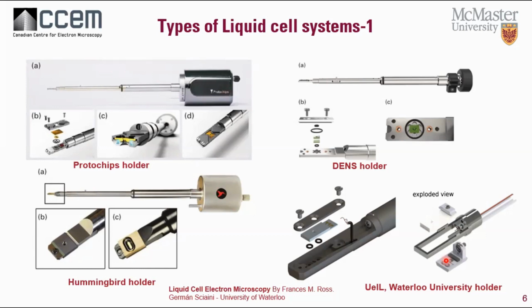Our center has two Poseidon holders from Protochips, so in all my presentation, I will focus on their design.